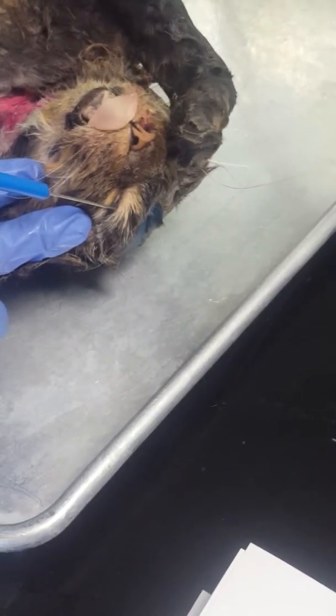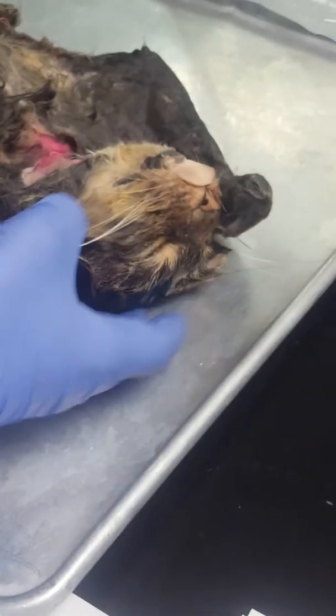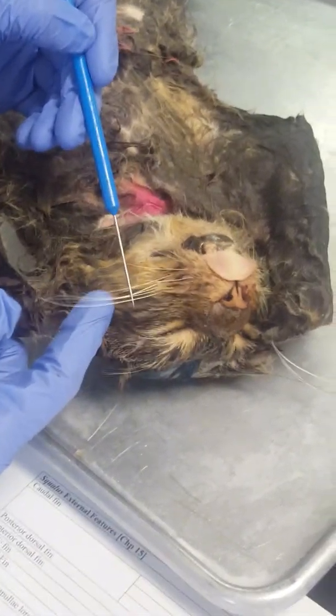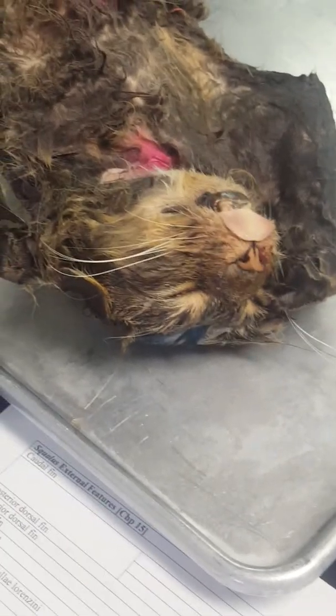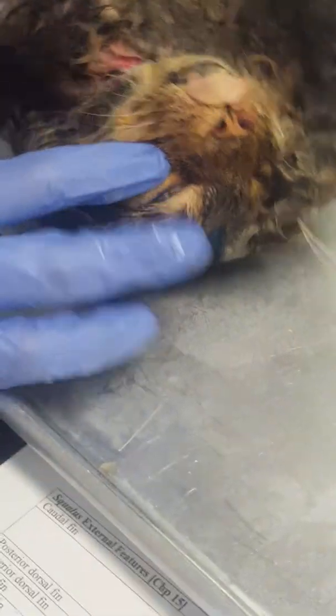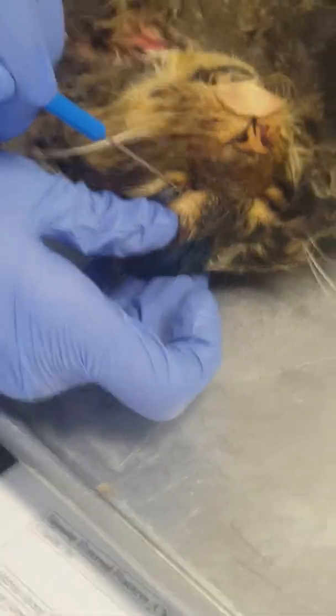Superior palpebra is the upper eyelid of the cat. Inferior palpebra is the lower eyelid of the cat, right here. External nares are right here and here. Vibrissae are the whiskers on the cat. Nictitating membrane is this inner membrane on the eye of the cat, right through there.